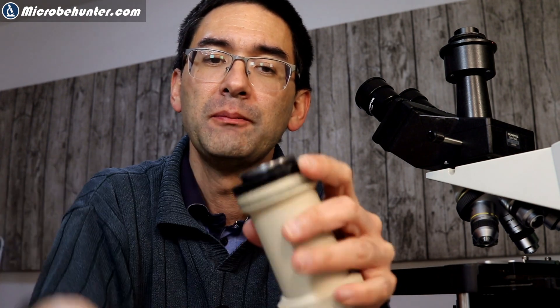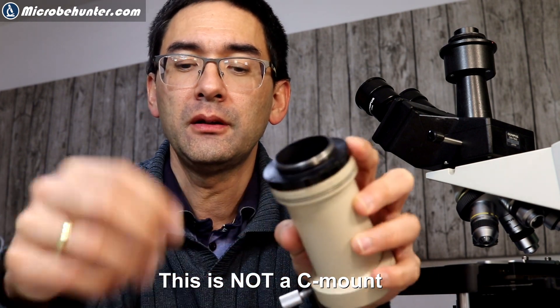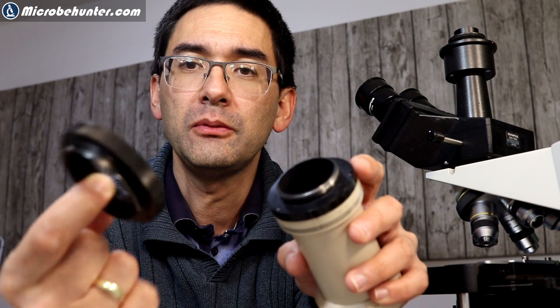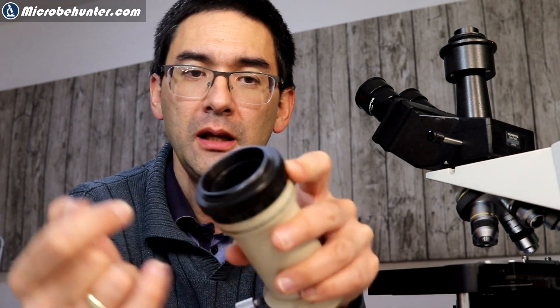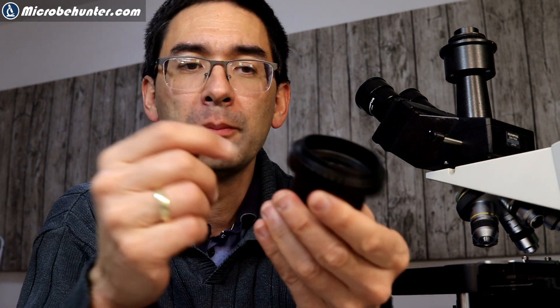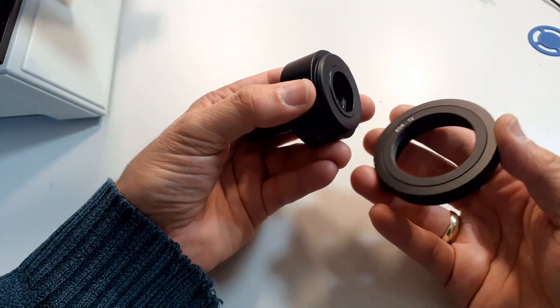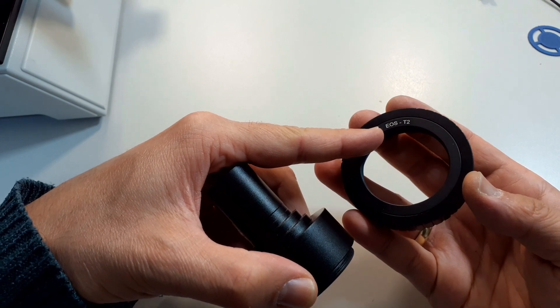The other adapter here is different — you can take it off. This is a so-called T2 adapter ring. When you take it off it looks very different. There is a threading here, and this means that depending on which camera you have, you can get yourself your own T2 adapter ring and connect it here, and then connect it to the camera.